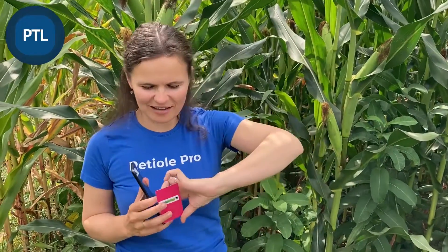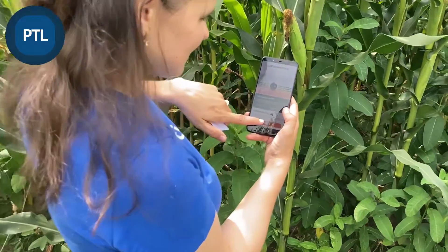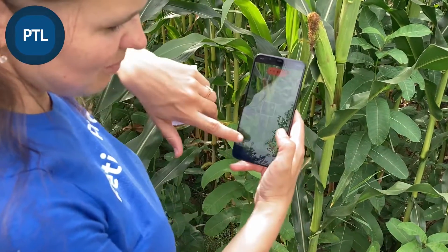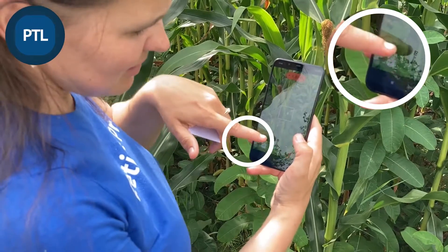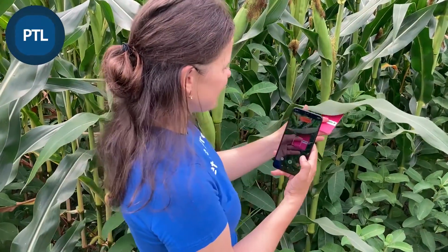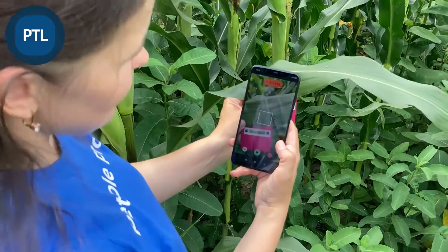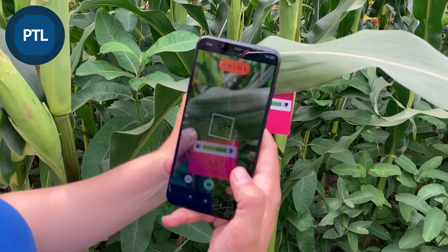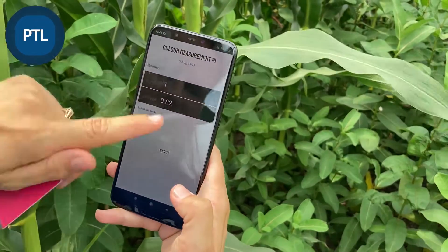So when you have the color calibration pad and the mobile application PTO PRO, you need to do very simple steps to measure it. Open the application, press the button with the checkerboard square — this button — and it will show you that QA mode is on. Then you need to place the color calibration pad below the leaf, keeping it at the level above the markers and the colors which are on the pad.